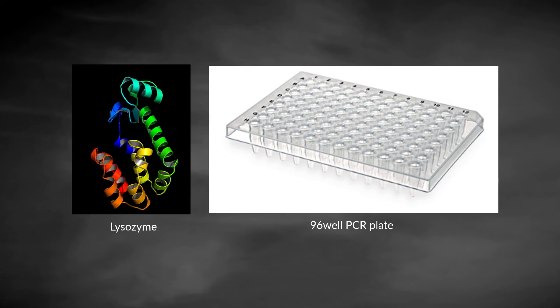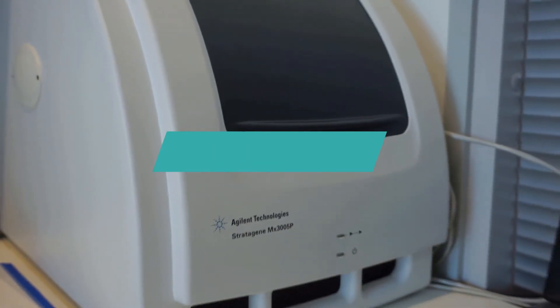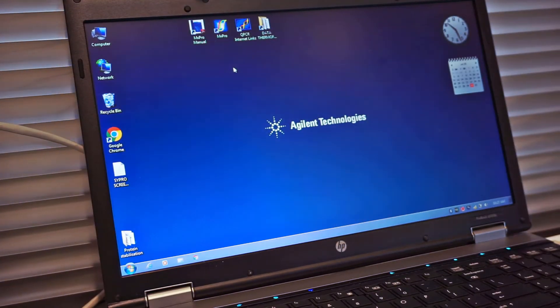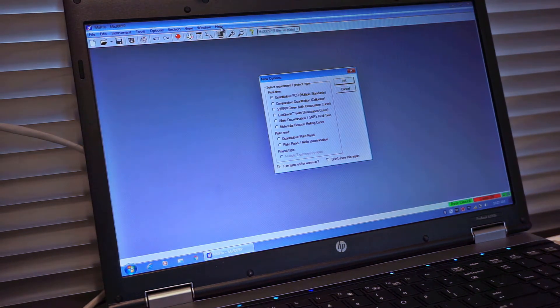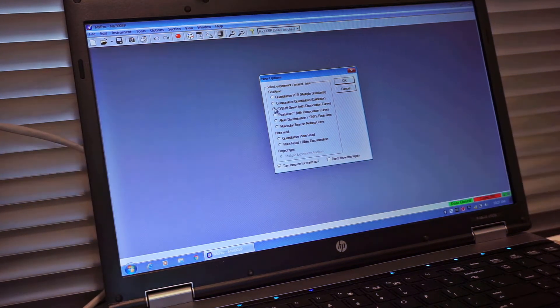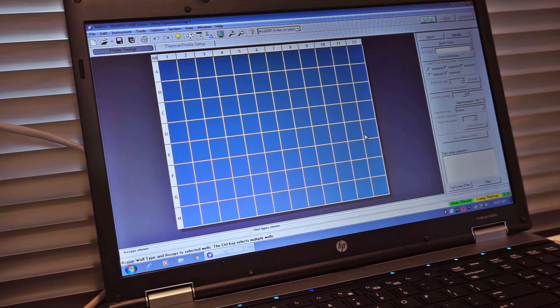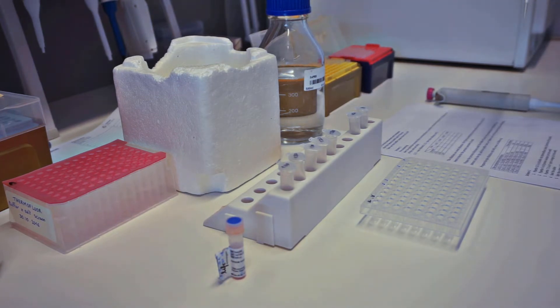Before starting, take out the dye and buffer screen from the fridge to equilibrate to room temperature. To start the experiment, turn on the real-time PCR instrument and the computer. Open the MX Pro qPCR software. Select the option Sybr Green with dissociation curve, and be sure that the option to turn the lamp on for warm-up is selected. Then press OK. While waiting for the lamp to warm up for around half an hour, we will do the experimental setup.